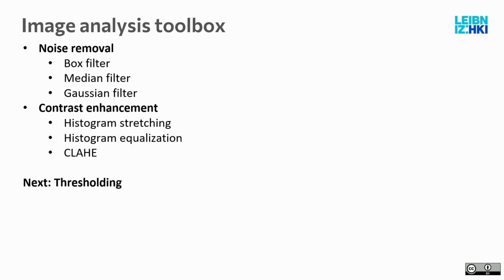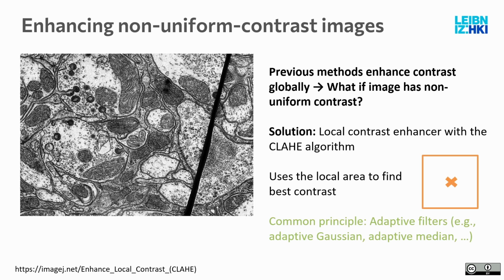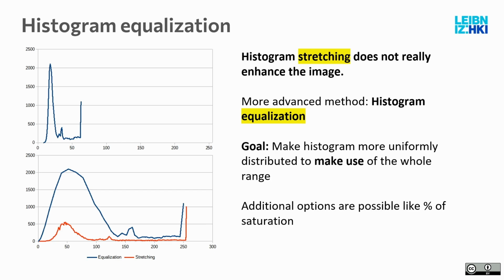Now, thresholding. Excuse me. Yes. I'm just wondering about the histogram stretching. When we are stretching, does it mean that we are also increasing the bits, or is it not related? So basically the bits are the whole range that is available. It's predetermined because it's part of the image itself. So it was already there, but we weren't using it. So you see here, this is my whole range, my boxes that I have available, but I only fill 1/3 of my boxes.